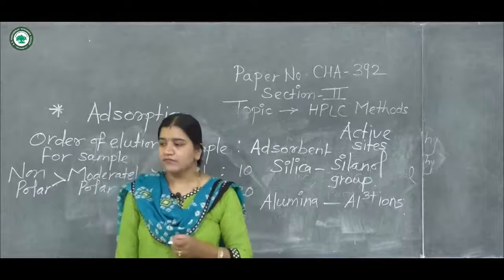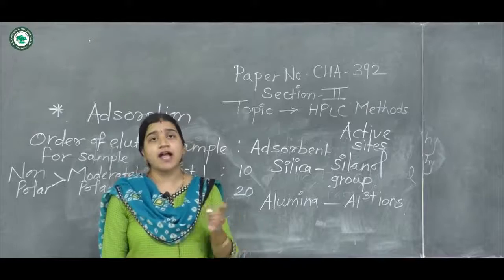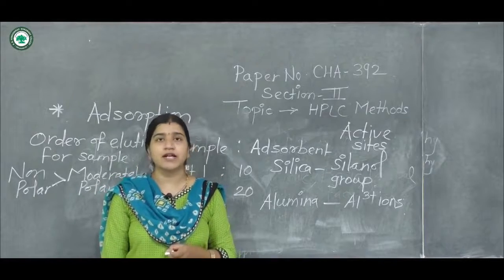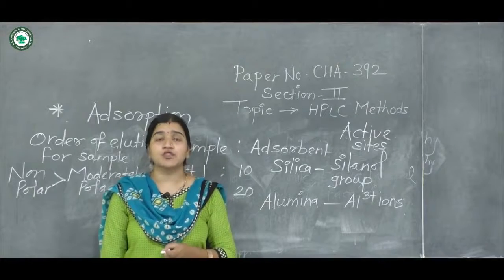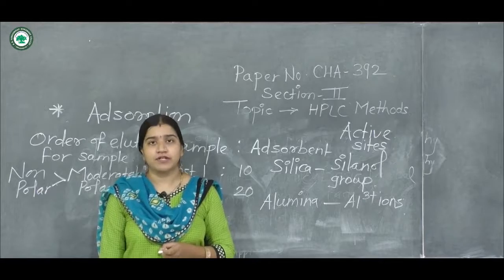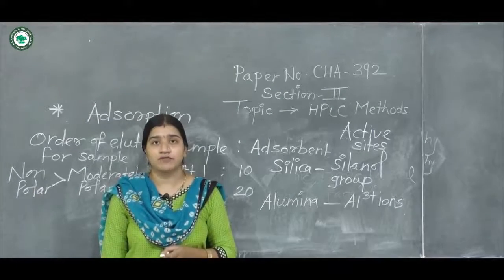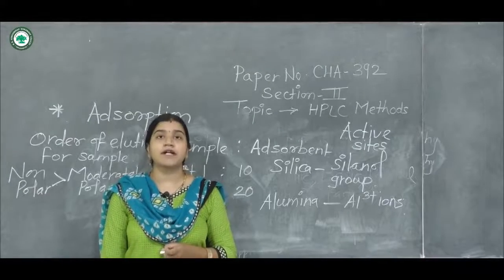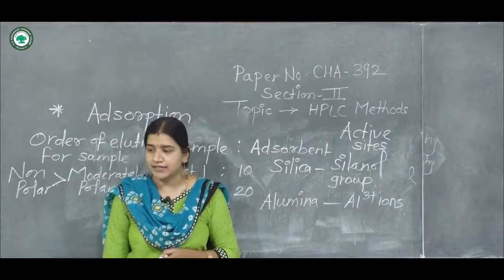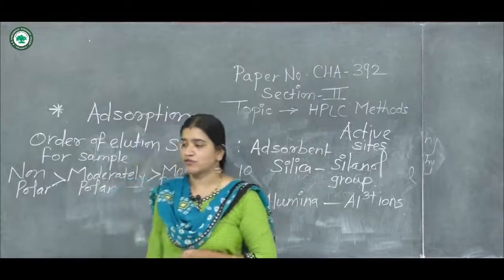After this active site and functional group interaction, you have the adsorbate-adsorbent interaction. Along with it, a number of interactions take place simultaneously in adsorption chromatography.